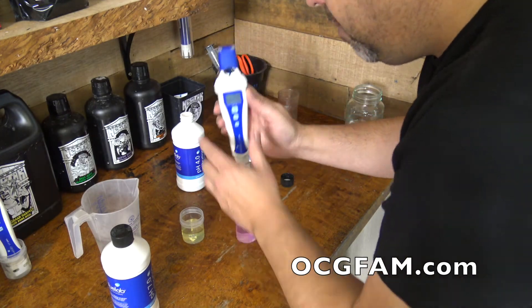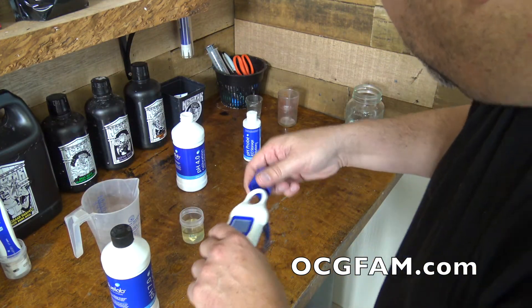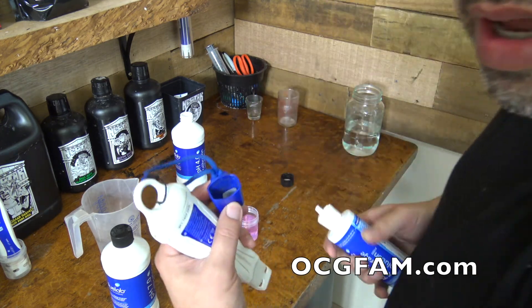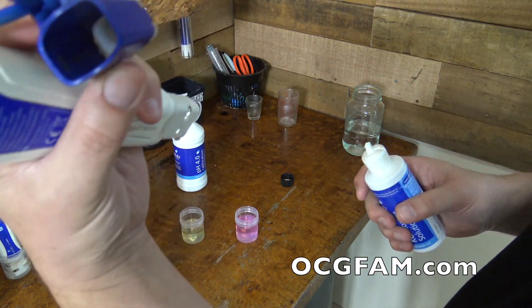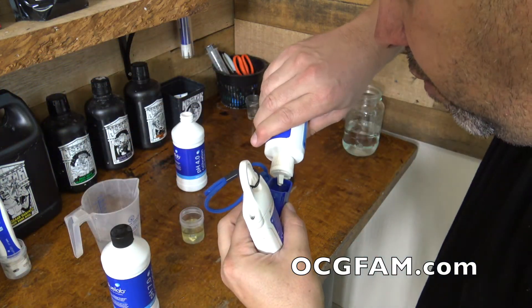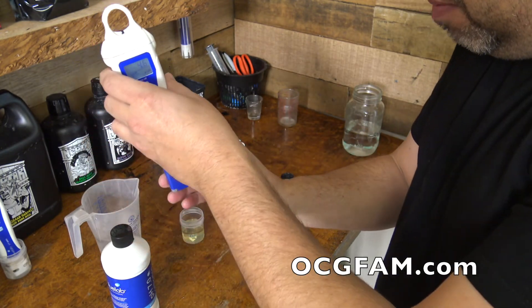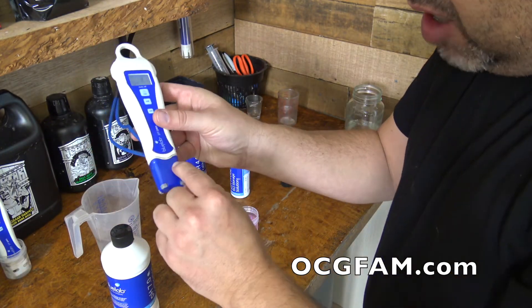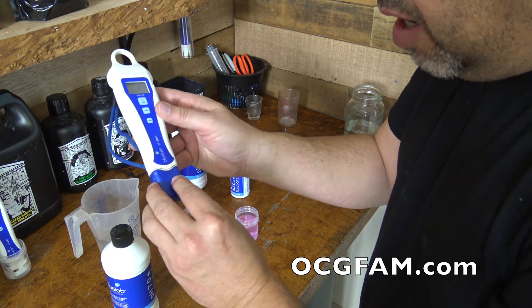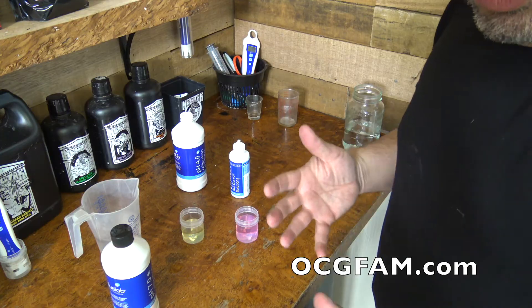Take it out, rinse it off in some water. Now this is the really important part — get the KCL solution. There's a little spongy thing inside the storage cap. Fill that up with three, four, five drops of the KCL solution, then put the meter back in there. That's going to keep the glass probe nice and cozy and safe. So put it back in the toolbox and we're good to go.